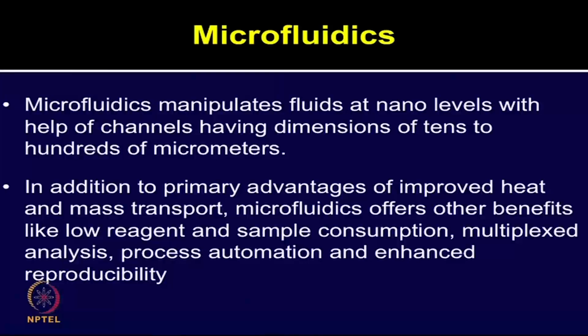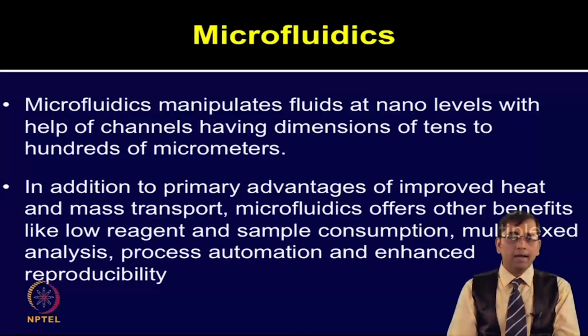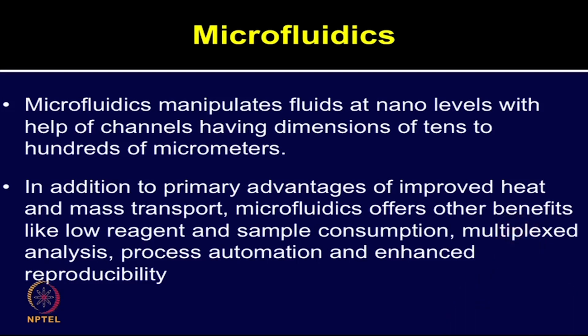Let us now discuss the next technology, which is microfluidics. Microfluidics deals with processing of ultra small fluid volumes with the help of 10 to 100 micron channels, which can provide sensitivity in the range of picomolar to femtomolar. Microfluidics deals with fluids at nano level with the help of channels having dimensions of tens to hundreds of micrometers.